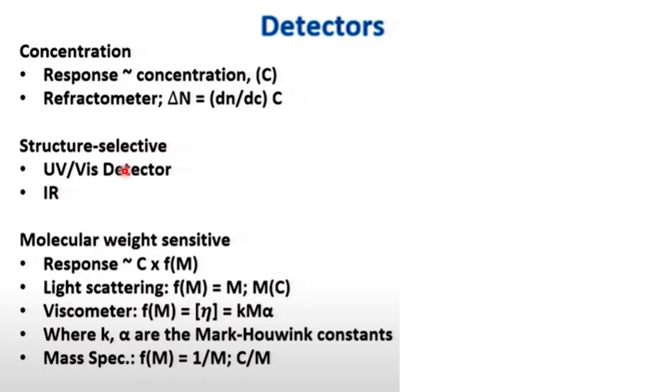So basically in conjunction with the GPC, a UV or IR setup is also required, so that the separated sample can be detected by different spectroscopic techniques.